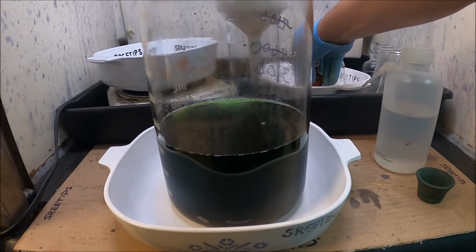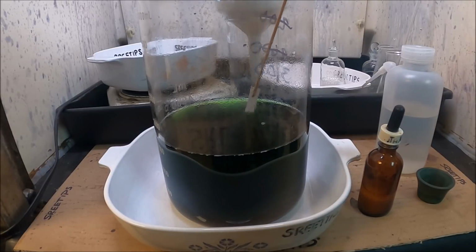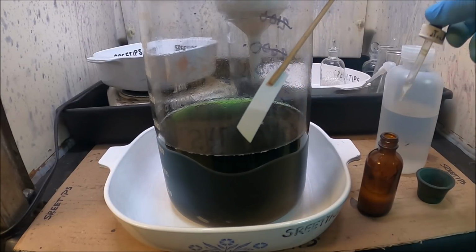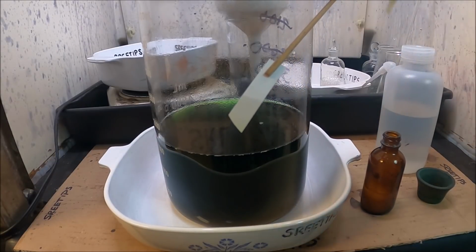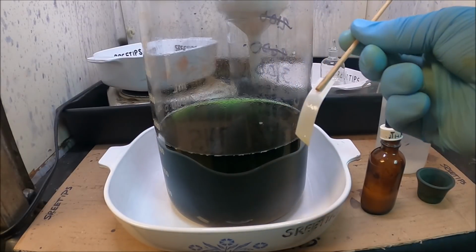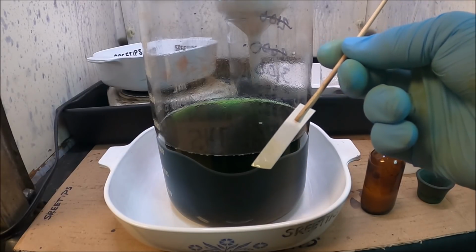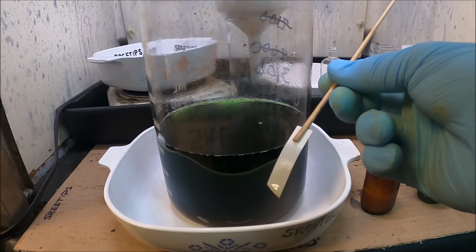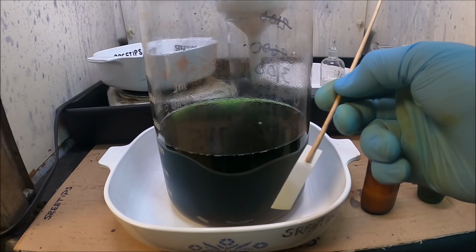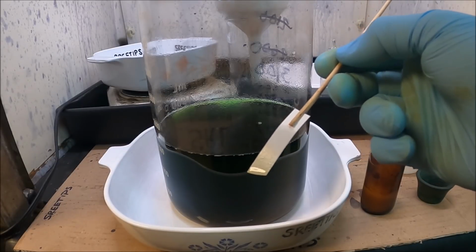It's been settling for about 20-25 minutes. I'm gonna reach in here with a piece of filter paper, do a stannous test on this waste solution, see if we got any gold remaining in solution. And as you can see by that stannous test, a little tint of color to it. Might be some platinum group metals present, but we've got all the gold out of our solution.